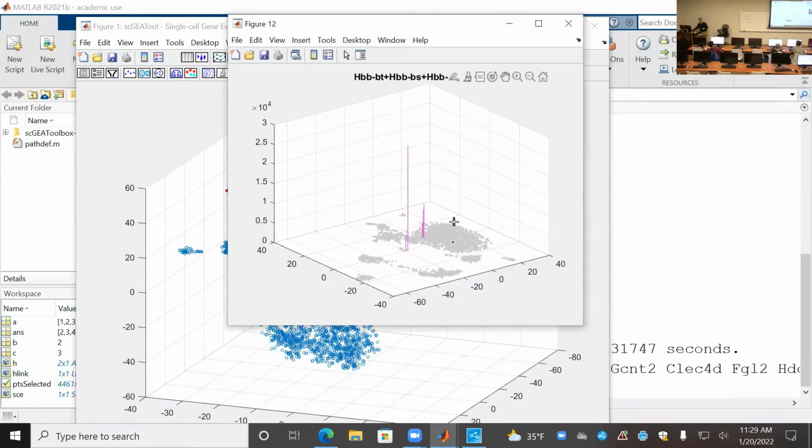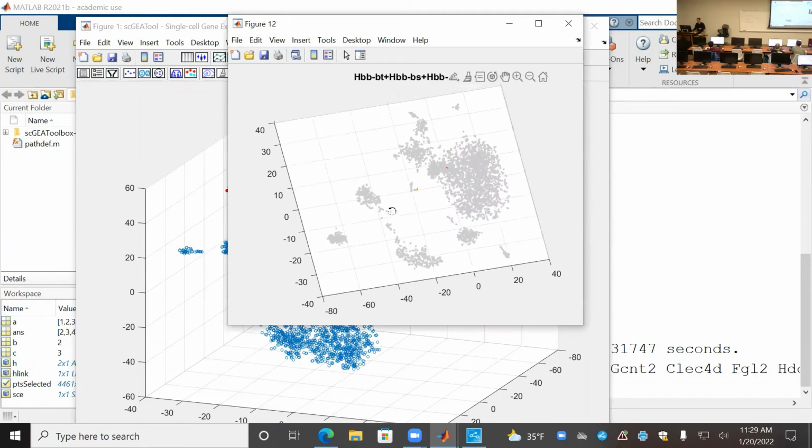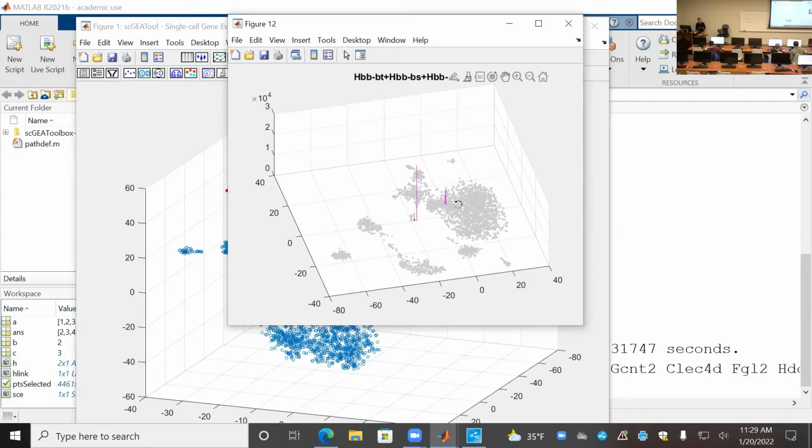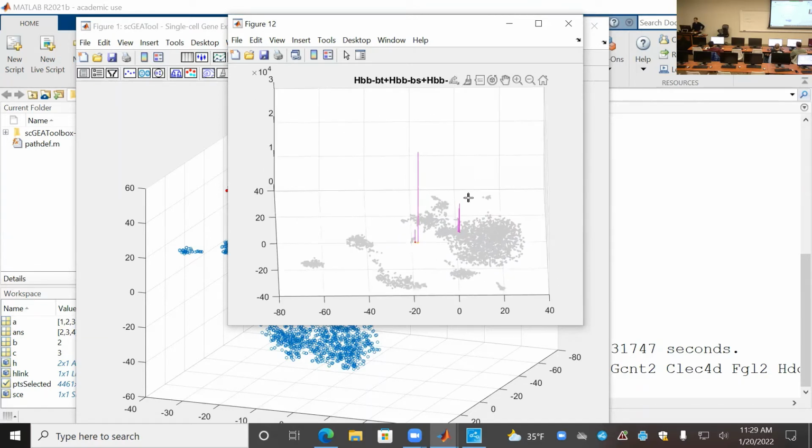We do have some, maybe. So this is a relatively clean data set. In some of the primary tissues you see a lot of blood cells. They're not very interesting actually, right? Because we know their function so well. So this chart is a combination of quite a lot of different blood cell marker genes.